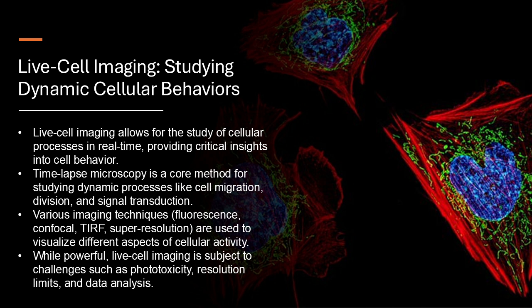Well, by observing cancer cells in real time, researchers can see how they interact with their environment, how they squeeze through those tiny blood vessels, and how they invade other tissues. So we're literally seeing these cells on the move, figuring out their escape routes. Precisely. And by understanding the mechanisms behind their movement, we can potentially develop new therapies to block their spread. It's like cutting off their escape routes before they even have a chance to get away. That's fascinating. It's like learning the enemy's tactics to outmaneuver them. So what other applications are there?